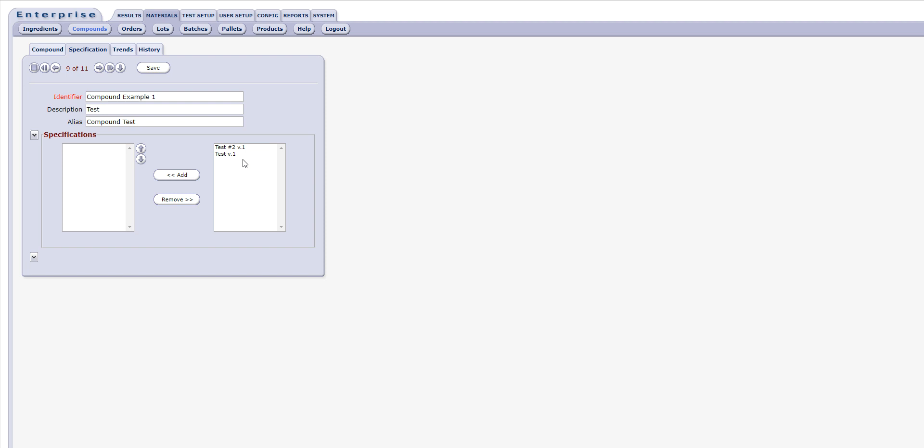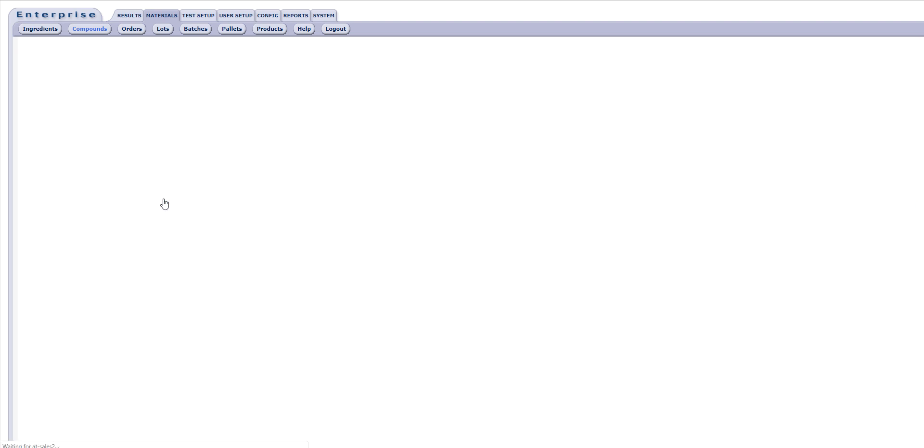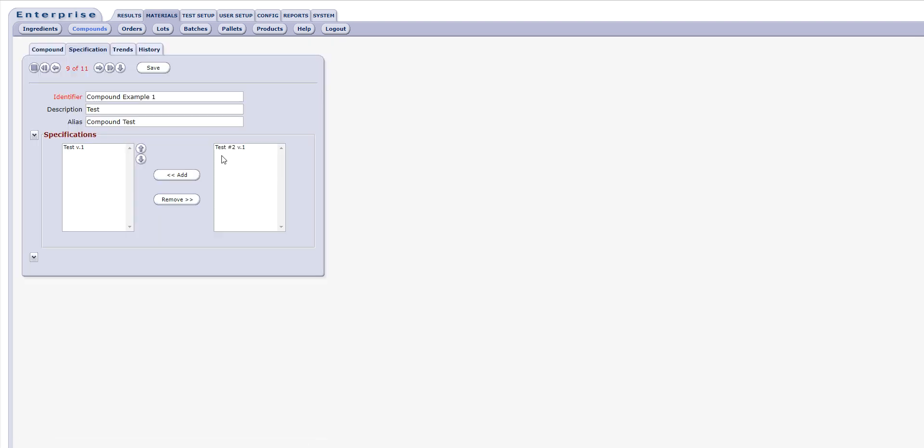A list of available specifications will appear in the right column of the Specifications area. The user can select the appropriate specs and use the Add button to assign them to the compound. The user can also remove specifications using the Remove button. Control-clicking will allow the user to multi-select the specifications for addition or removal.